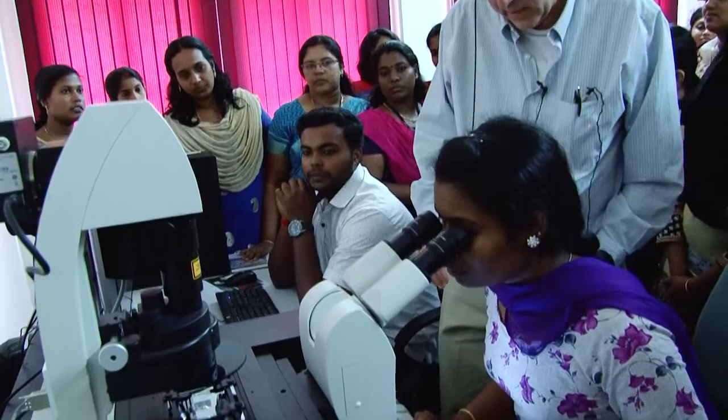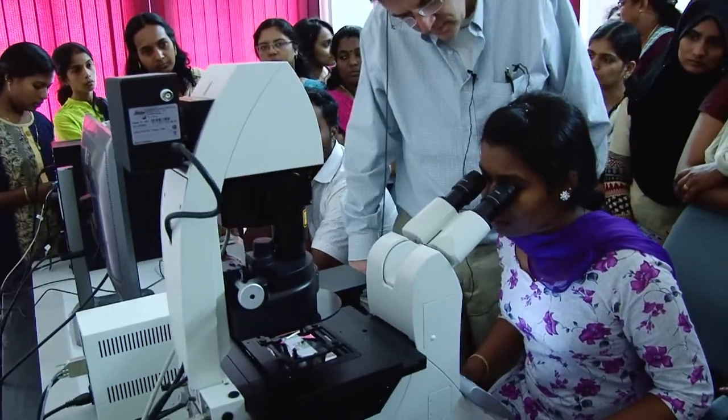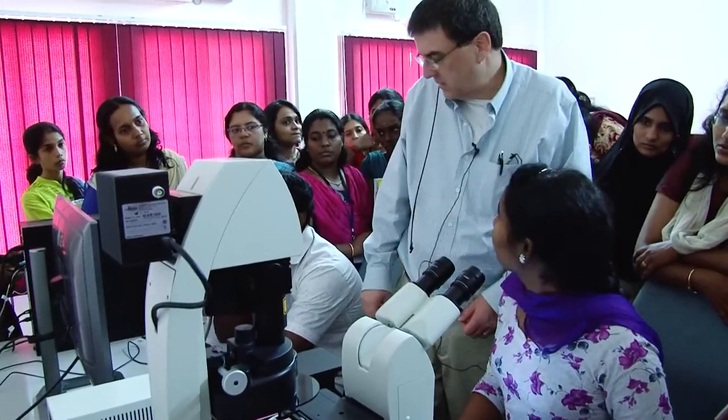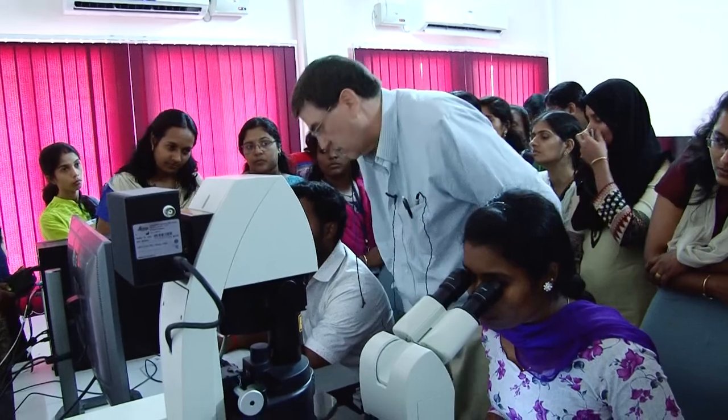So do you see something? Yeah. Okay, what's it look like? Bunch of circles? Section. Yeah. Okay, so you found something. Okay, so let's send it back over to Confocal. Now what colors do you use for this? Okay.